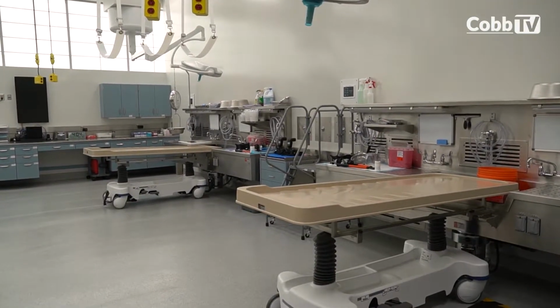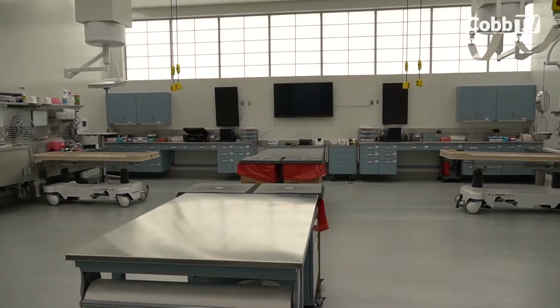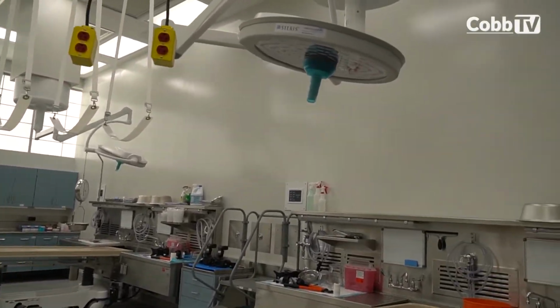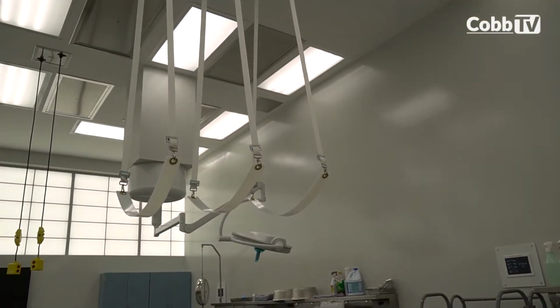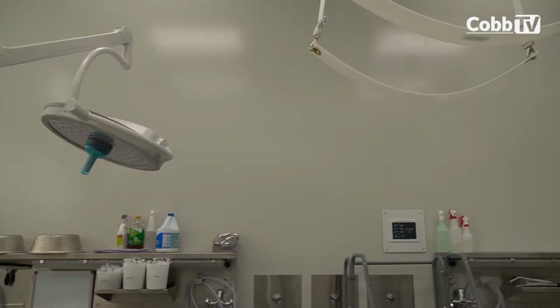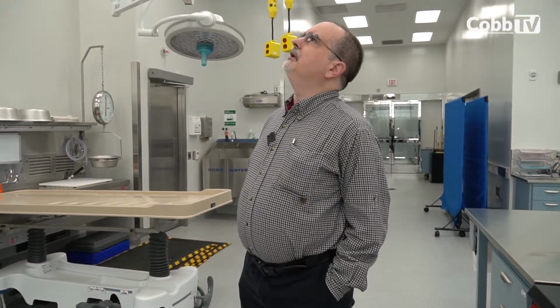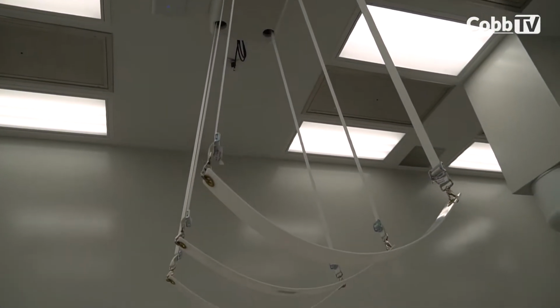The video monitors on the wall are designed to project x-rays, whole body x-rays, so we can see the decedent all at once. The surgical lights are there to provide additional lighting inside the decedent in dark areas that the standard lighting is not able to reach, or to provide additional light to any other point that needs to be there. We have a body lift directly above that is capable of lifting up to 1,000 pounds. We haven't had a 1,000-pound decedent, but we've gotten quite close. This allows us to manipulate them without hurting ourselves.